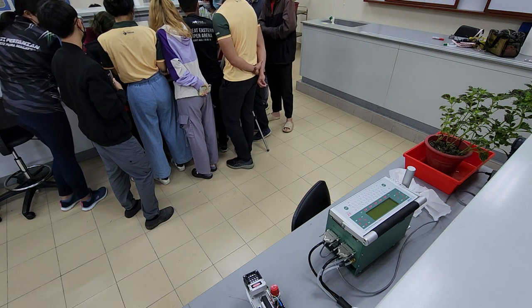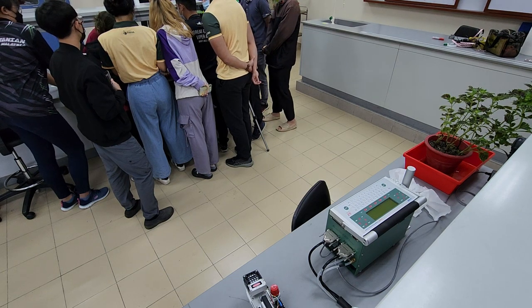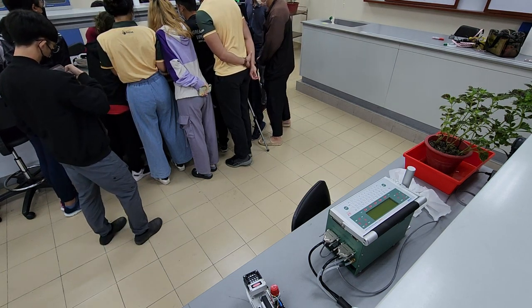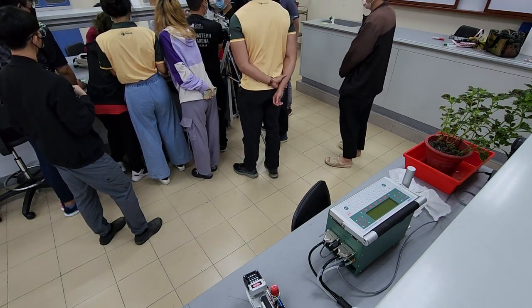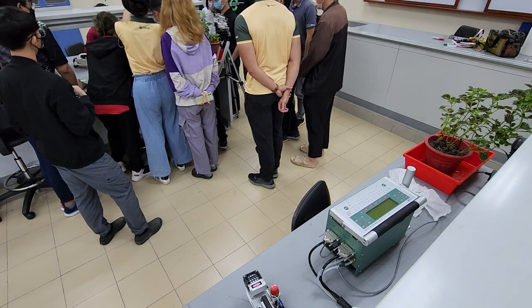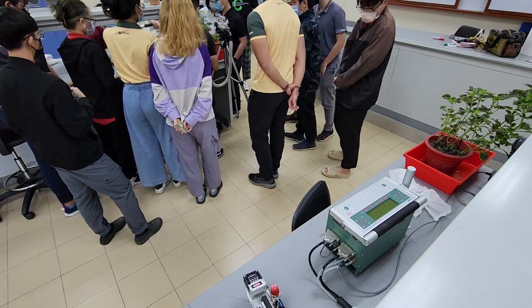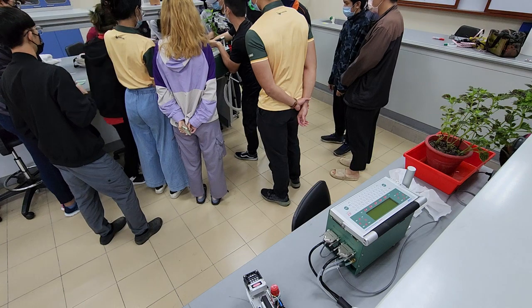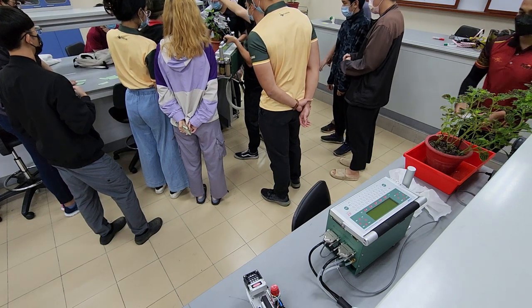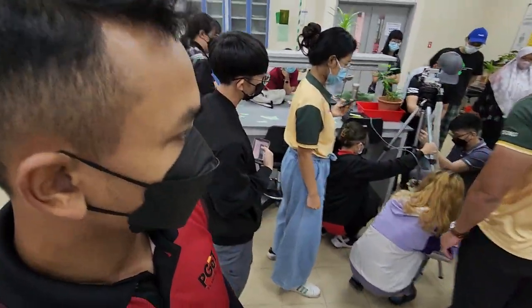The reference, yeah, this one. The second, you know what? Why don't you bring the console kat bawah so that it's more accessible. Okay. Shut down the machine first. No. Just bring, just put it on the floor. Is the cable long? This tripod, reduce the height so that it's floor level.